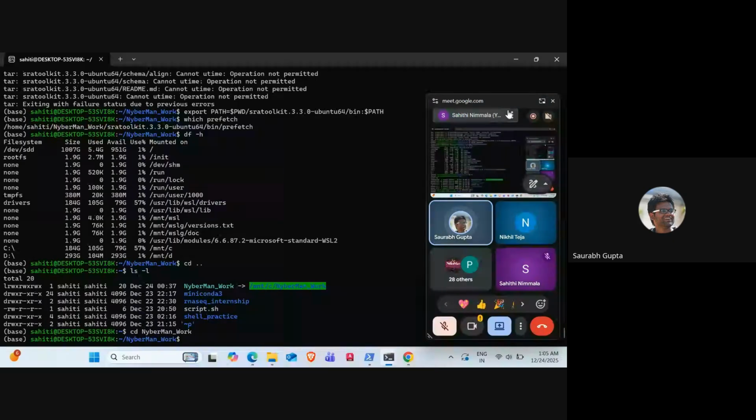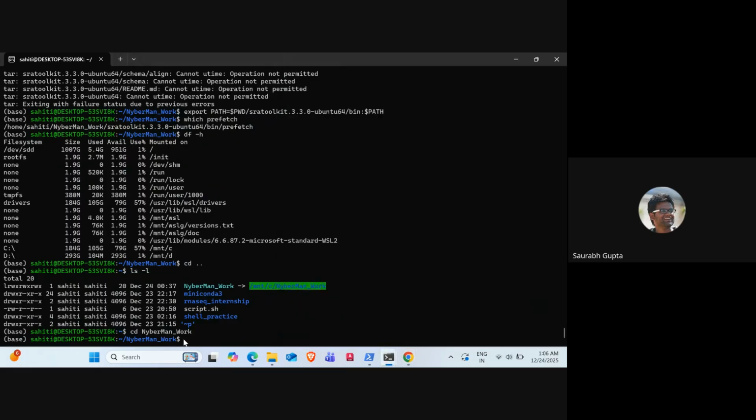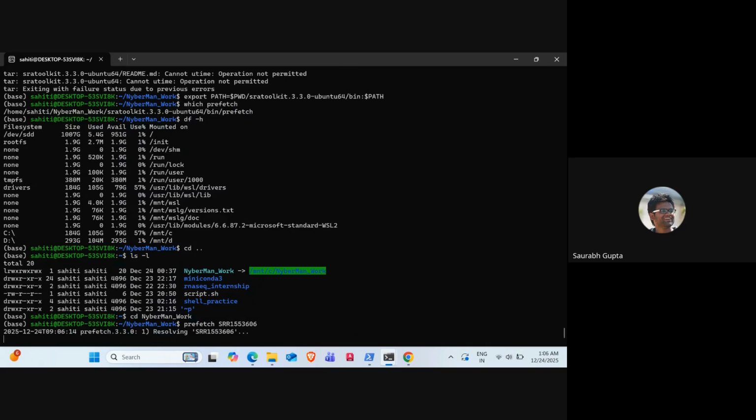Now run the prefetch command, Saiti. The prefetch space SRR command was there in the slides. I'll type it in the chat also. Okay, once again. Yeah, can you type this? Good, it's working.